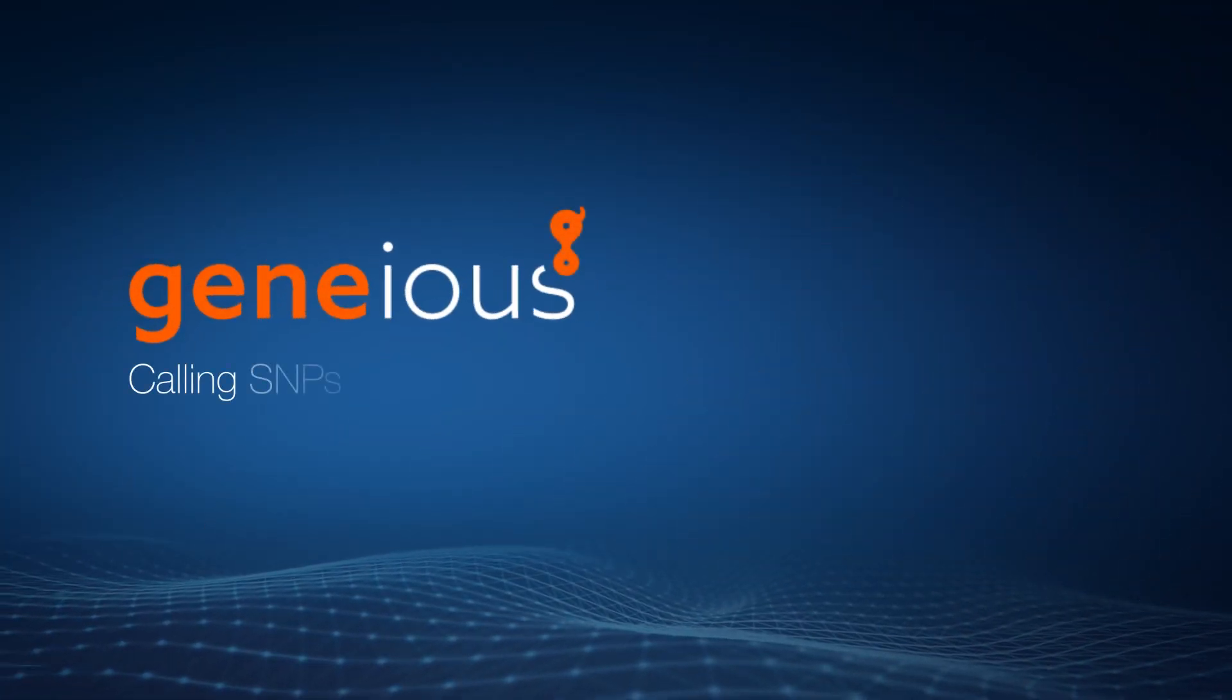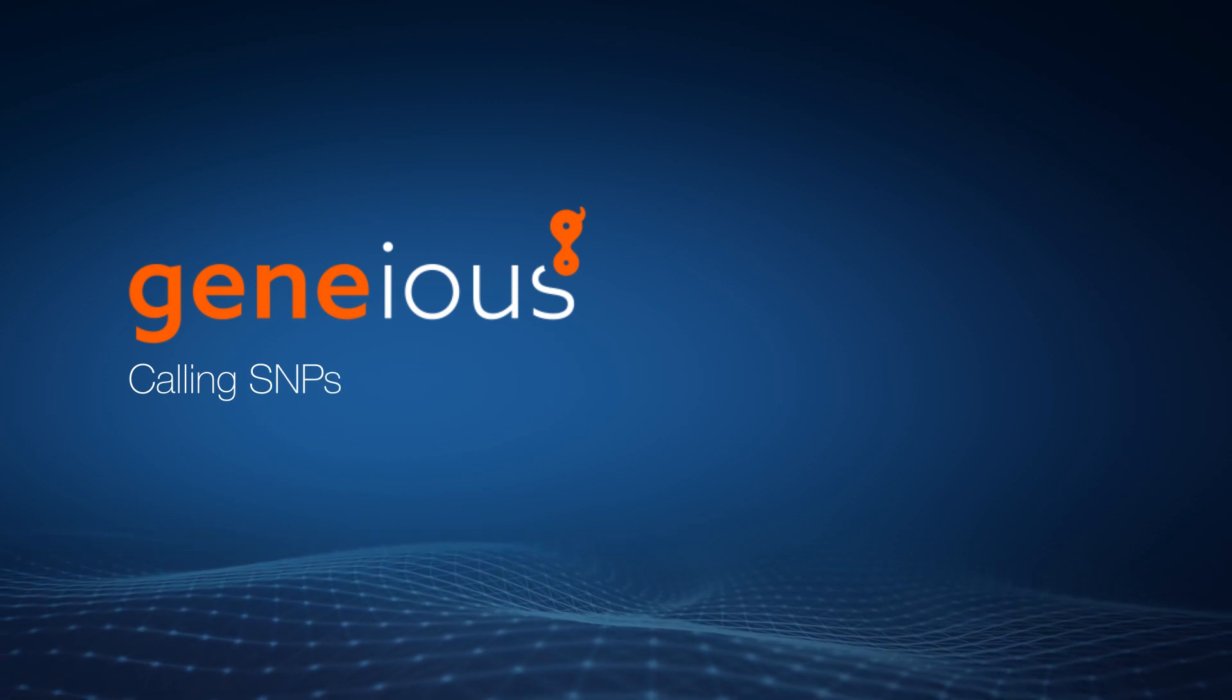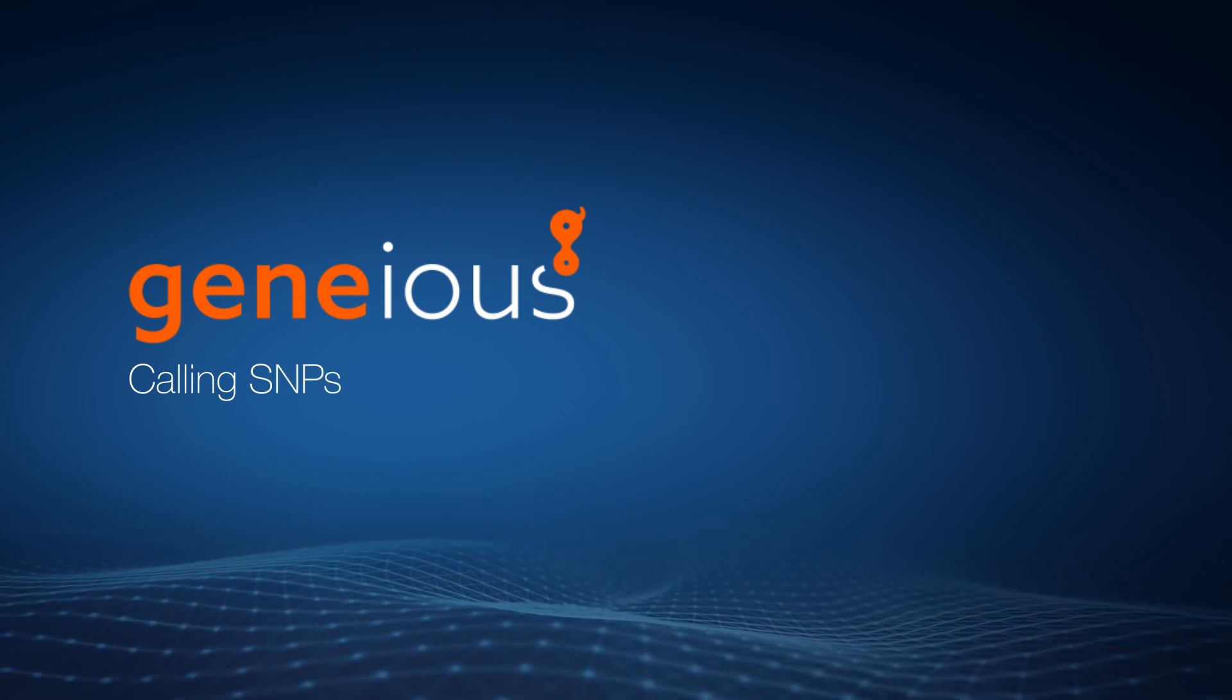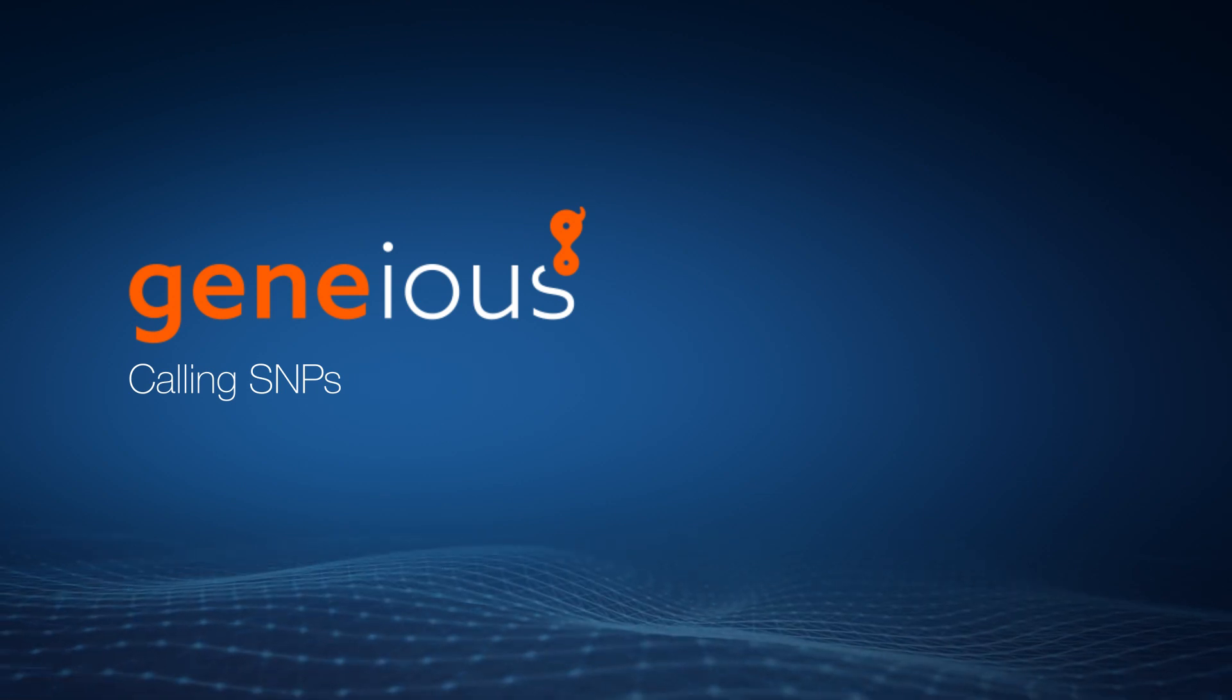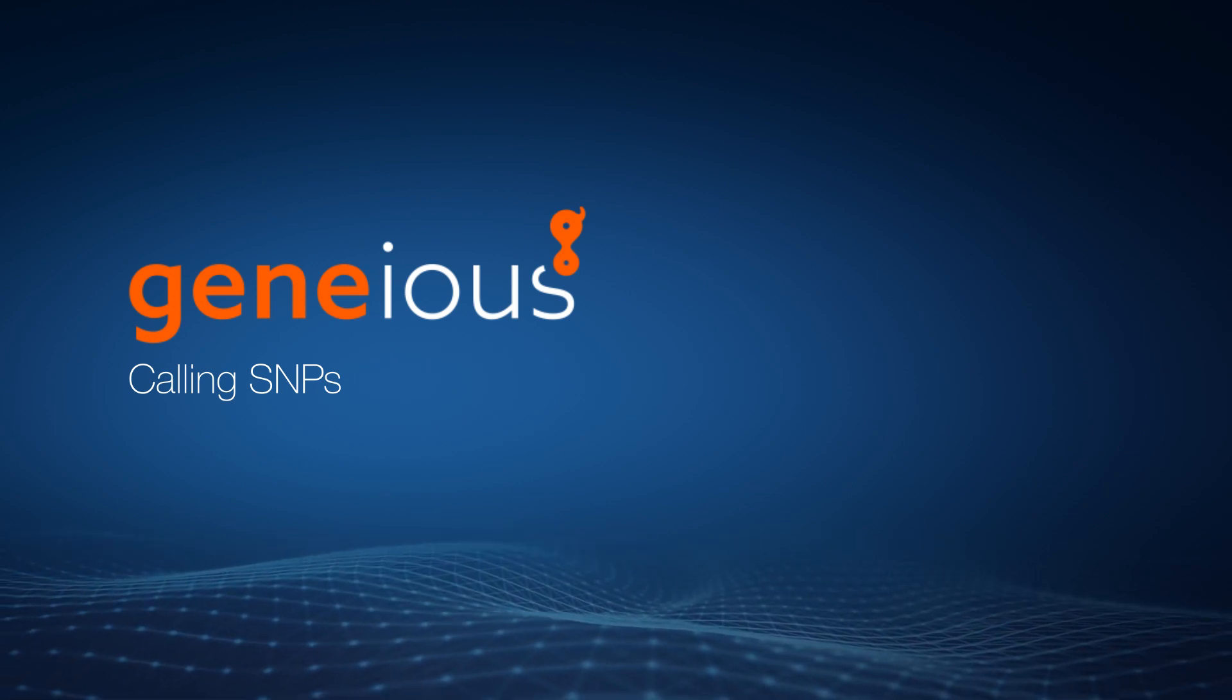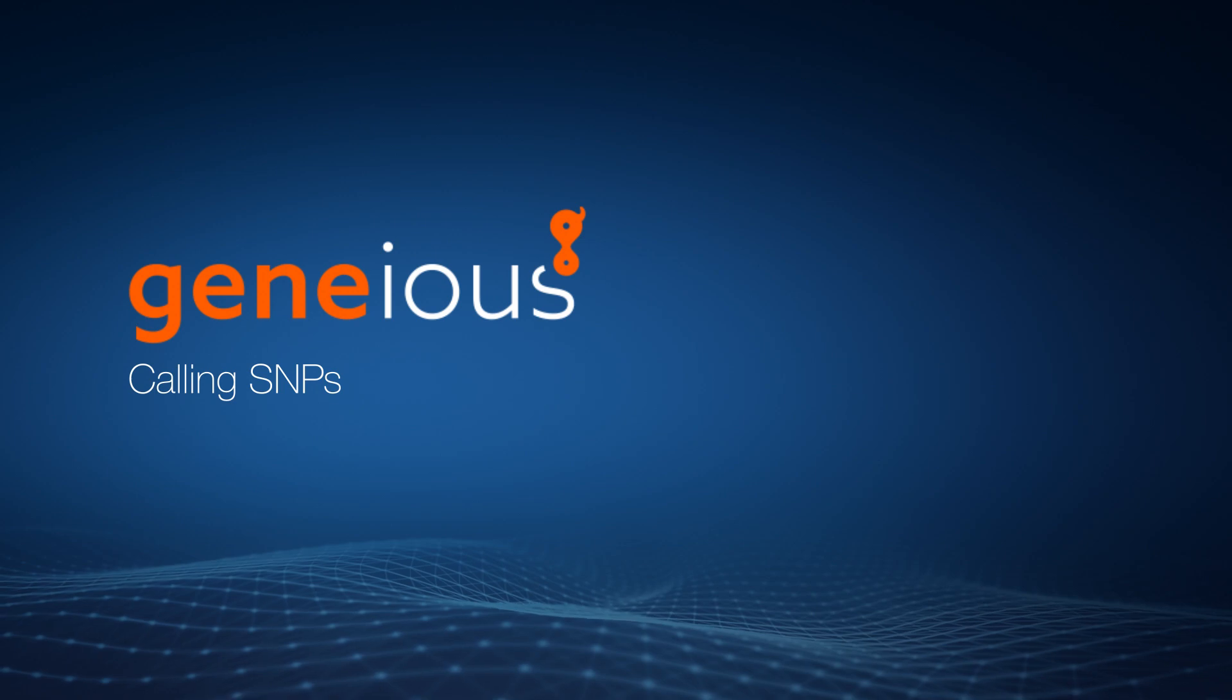Welcome to this video on calling single-nucleotide polymorphisms with Genius Prime. To begin, you must prepare your CONTIG document. See the mapped reference video for how to do this.